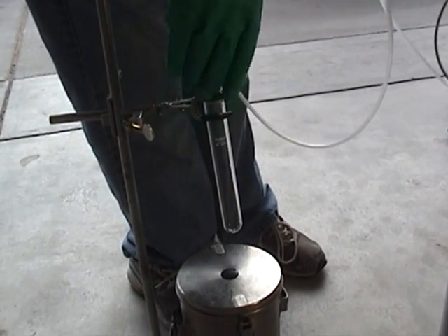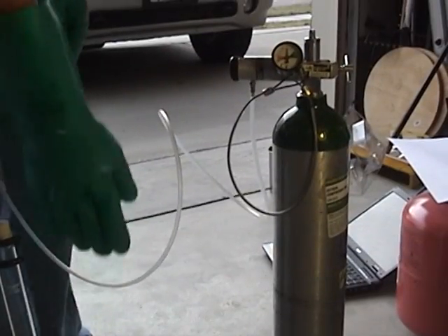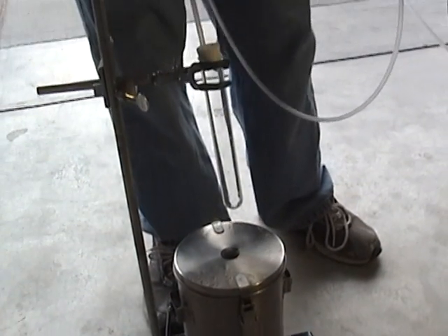Liquid Oxygen. I have my test tube with a tube going to my oxygen tank, my liquid nitrogen, and my oxygen tank. I'm going to be running it in here at about 8 liters per minute.